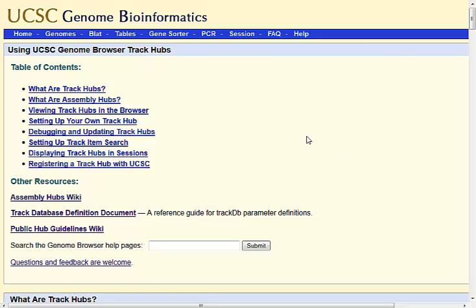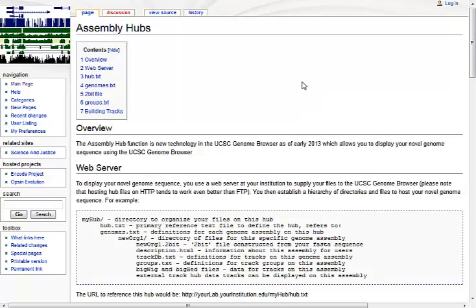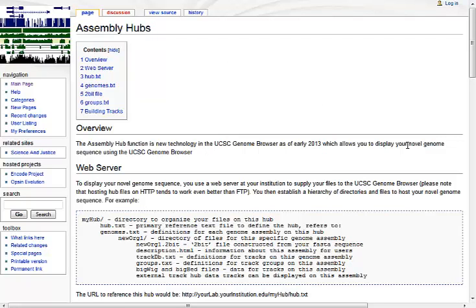But in addition to using the existing reference genomes and adding your types of annotations onto that, you can also create entirely new genome assemblies with the Assembly Hub. Even if UCSC doesn't host a reference genome for the species or the project you're interested in, you can create an Assembly Hub that stores and provides that information as well. Click Assembly Hubs here for the wiki details that will help you understand how that functions.